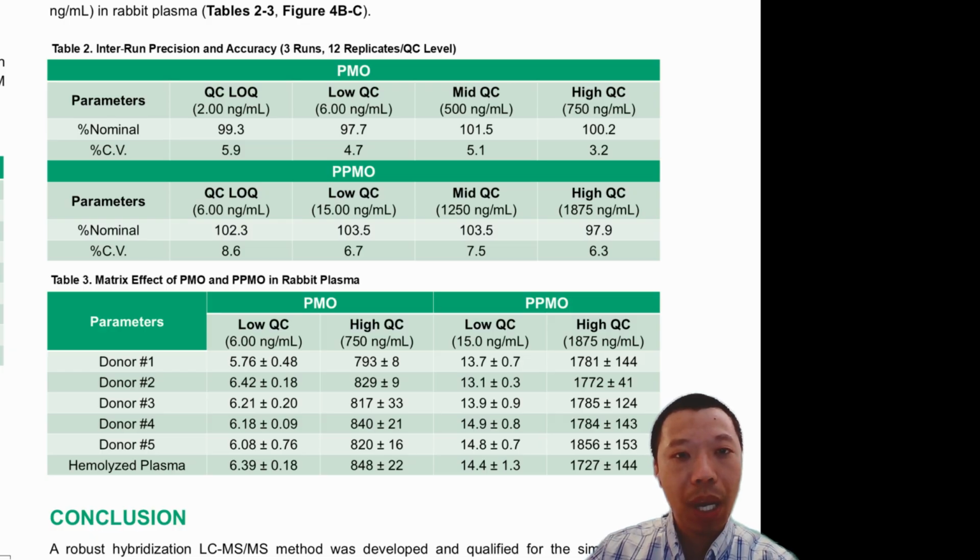For PPMO, accuracy ranged from 97.9% to 103.5% with precision below 9%. These results indicate reliable and consistent performance across the calibration range.